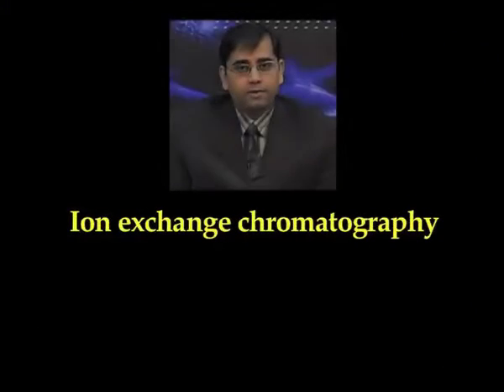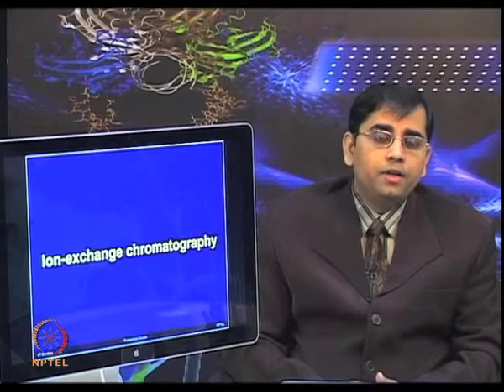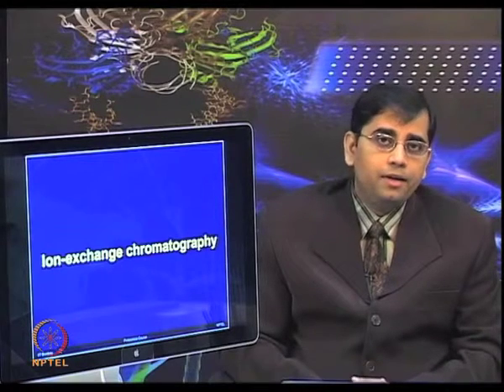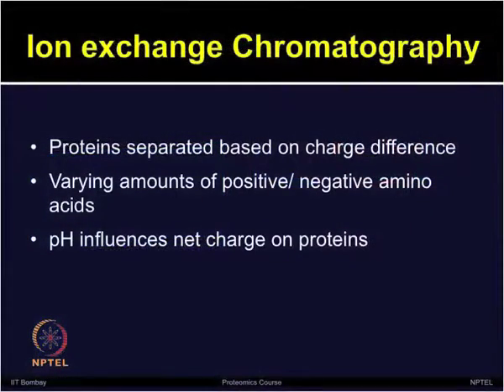Ion exchange chromatography is one of the most versatile chromatographic separation methods, which relies on differences in the number of charges and distribution of charge groups in defined pH and solvent conditions. In ion exchange chromatography, the proteins are separated based on charge difference. Proteins with overall negative charge will interact with positive charges, or vice versa.